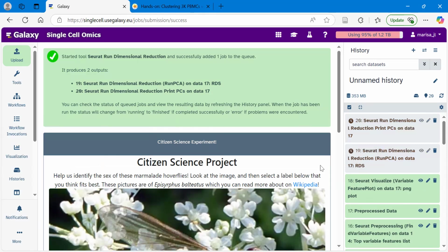And you can see here again, we're going to have 2 outputs from that tool. The first one is the Seurat object, which has the PCA results in it. And the second one will be this list of the top genes associated with our top 5 PCs. If that doesn't make too much sense to you, you should read through the tutorial, because it does explain what I'm talking about here when I'm talking about PCs and the top genes in them. Hopefully that will make a bit more sense to you after you've read through that. After this, we're going to visualize the results of this PCA and show you different ways to understand how the variable genes and the top genes in these PCs relate to our data set and the principal components that we're calculating. I think this could take a little while to get started, so I'll just pause the video and come back to you once it has finished.